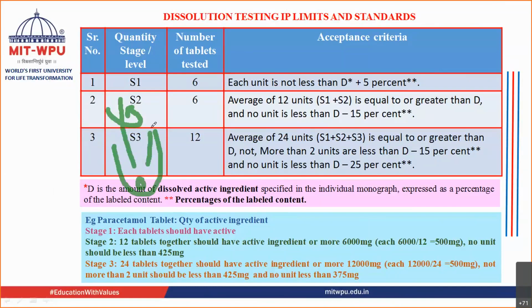You are removing the sample and evaluating it. You are carrying out the assay and determining how much drug has been released from it. Clear? Got it? So within 10 minutes, how much drug has been released? Within 20 minutes? Within 30 minutes? And within 1 hour?